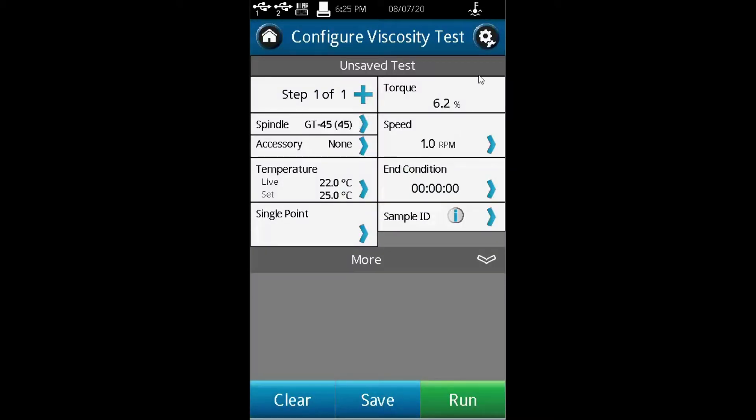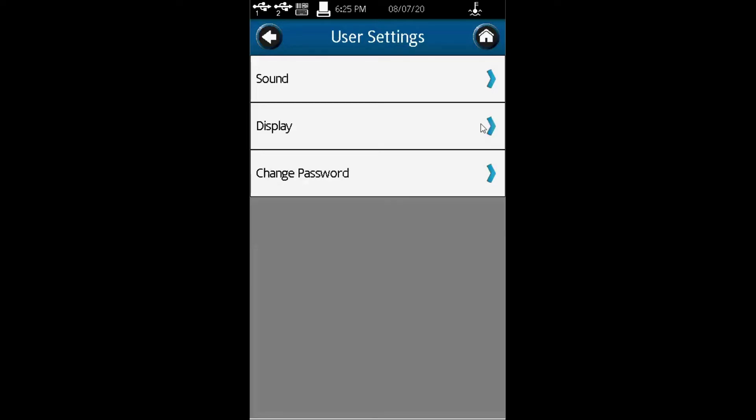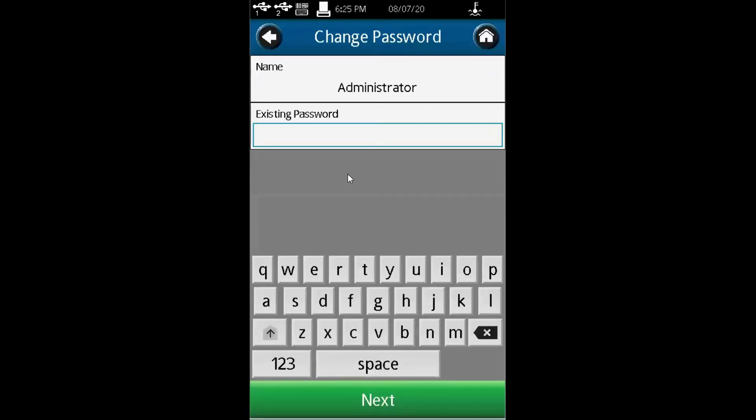When you go to the tool icon and click on it, it shows you the device, user settings, global settings, and admin functions. Under user settings, you can see sound, display, or change your password.